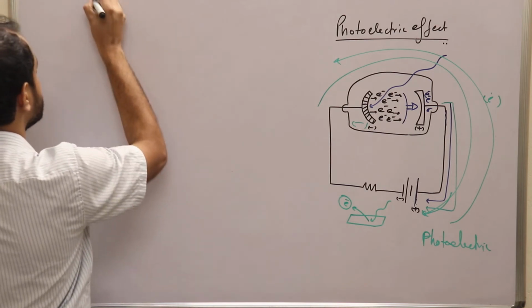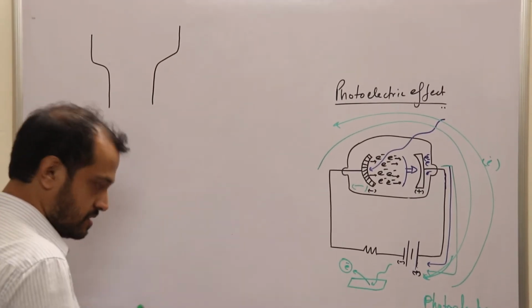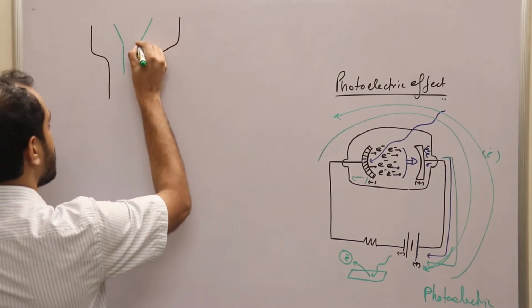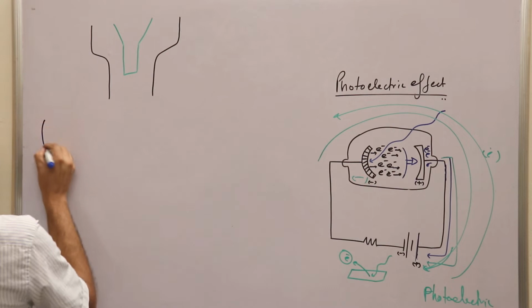This was the fluidic system, right? It generates a column of cells, a single cell at a time, by hydrodynamic focusing. Very good. One cell at a time. This is the laser system.